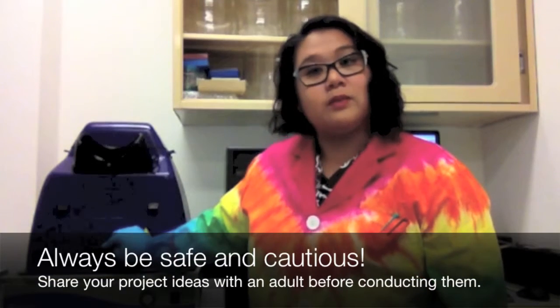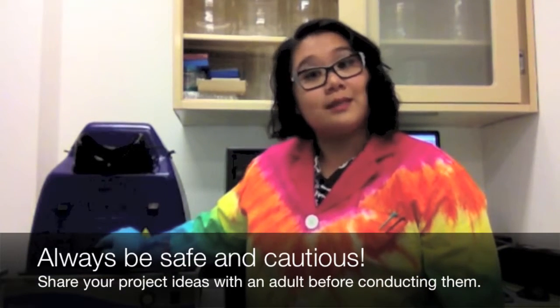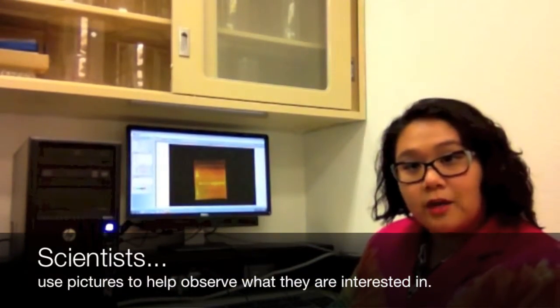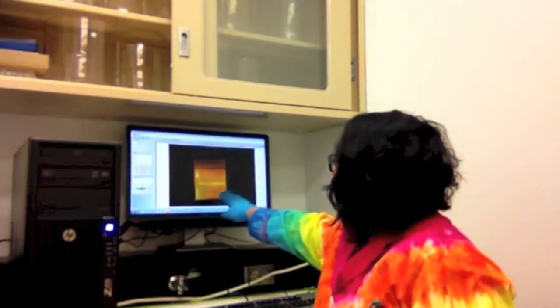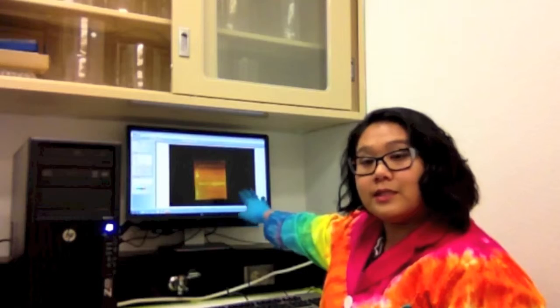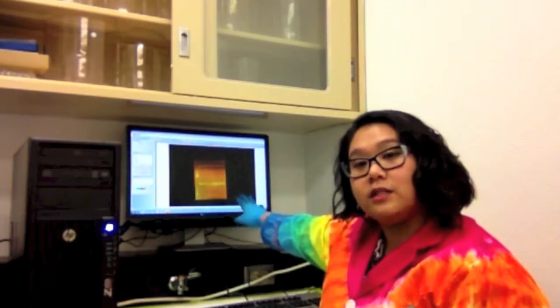The reason we close this cabinet is because UV light will damage your eyes, and that's why you wear sunglasses when you're outside. So now that we've turned on our gel, we can look on the computer because there's a camera in the darkroom that's taking pictures. Now what we can see here is that our DNA is lit up. And this is what the ethidium bromide does for us, it allows us to see the DNA lit up on the gel just like you would a picture on a film.